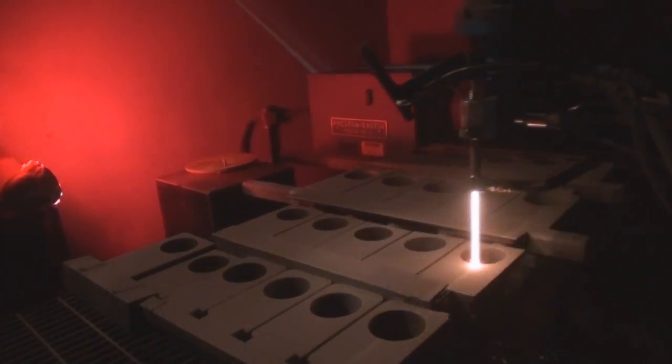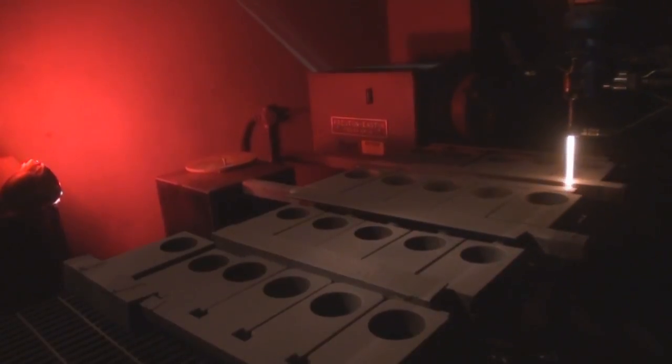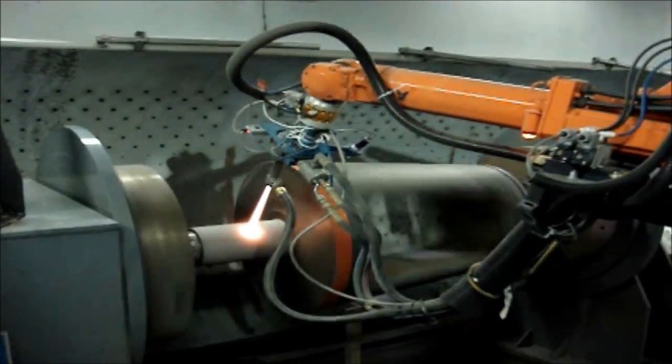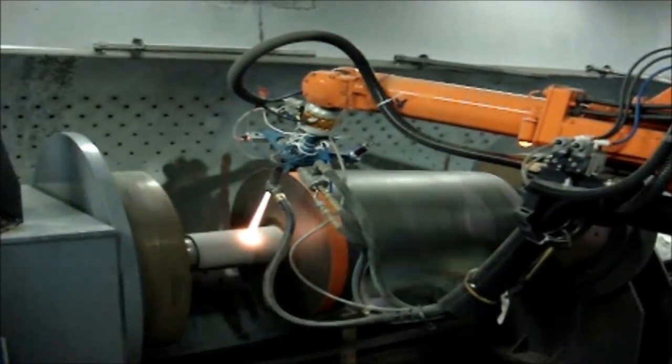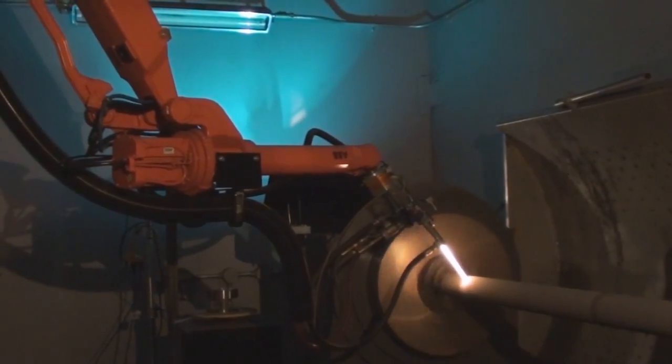After we have tested the powder, it is sent to our robotic thermal spray facility where it is applied to parts or test coupons. At this point, we can perform additional testing on the applied coating itself.